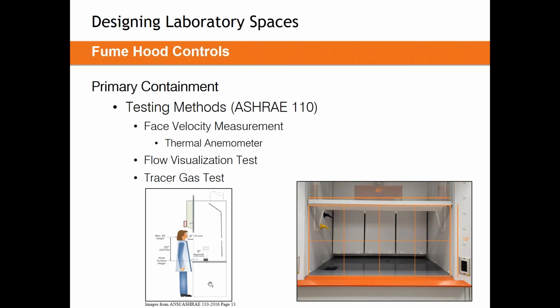In an ideal scenario, every single fume hood that is ever installed and started up gets all 3 of these tests performed. In my experience, that really doesn't happen.